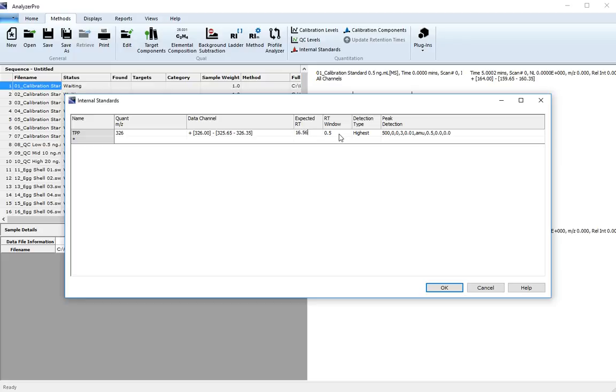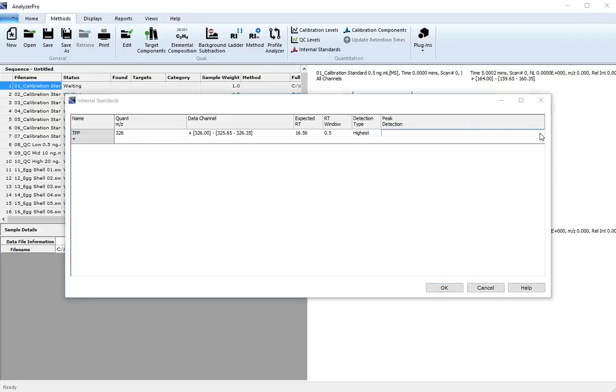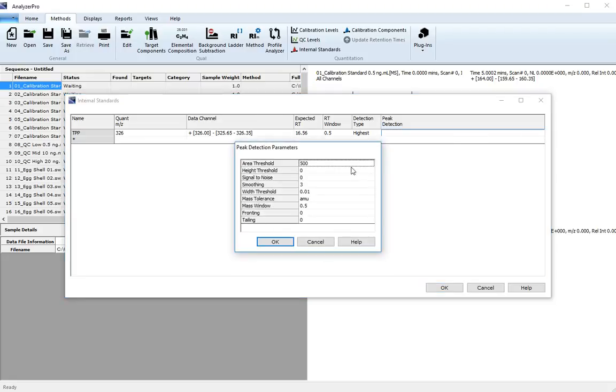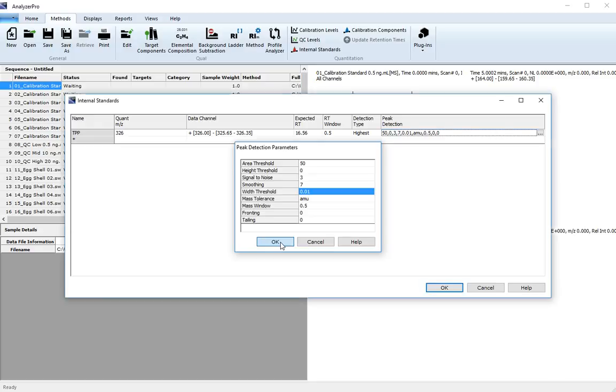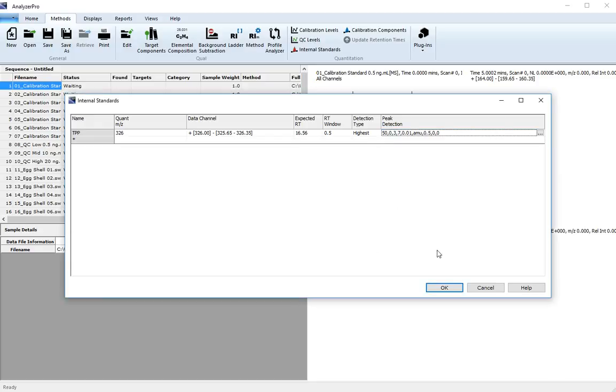We can leave the retention time window at 0.5, the detection type at highest, and the peak detection parameters will be as follows. Click OK and OK again.